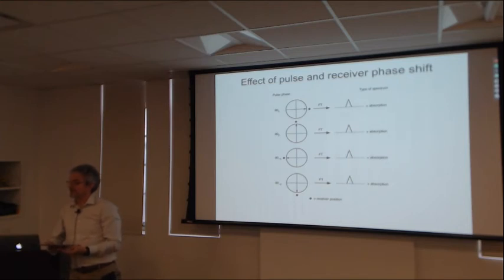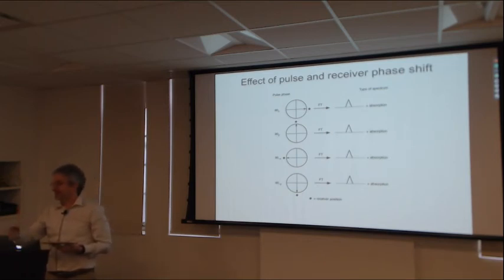So you will only detect coherence order -1. Anything else that you end up with won't be detected. So your pulse sequence has to have the last pulse generate what you want at a -1 coherence order. And then that last step, you get the selection for free. All the other coherence orders can't be detected. But your last pulse has to make sure that you transfer magnetization from whatever operator you had to at least partially to -1. Otherwise, your experiment doesn't work.